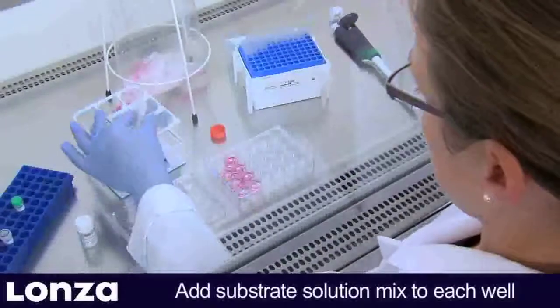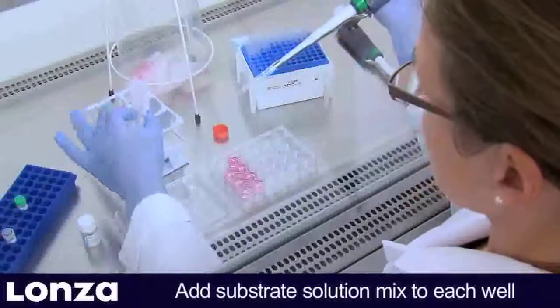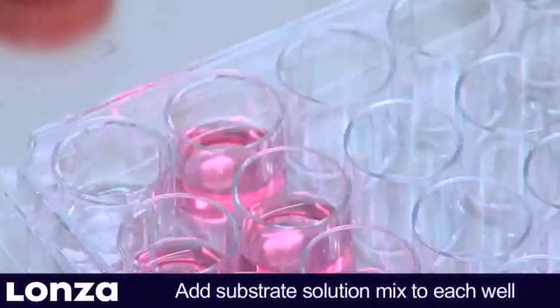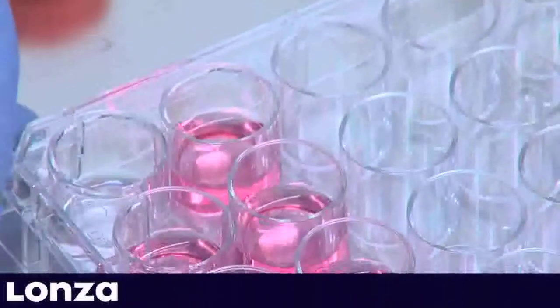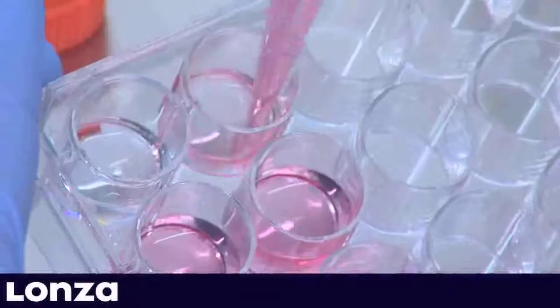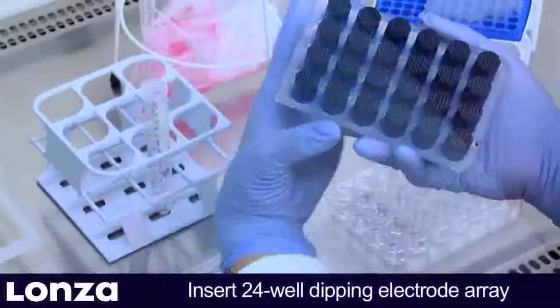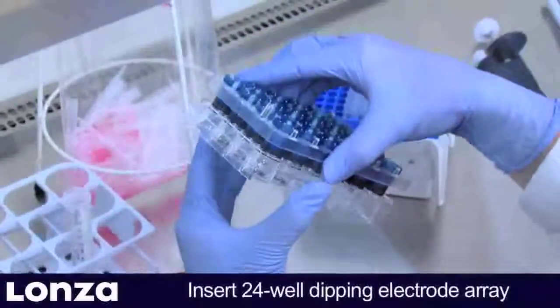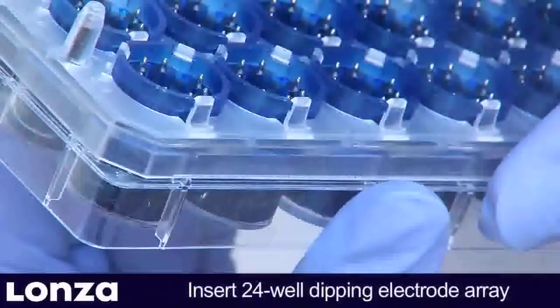Then add substrate solution mix to the well. To avoid leaving cells without liquid coverage, it is recommended to perform media removal and addition of substrate solution mix one well at a time. When inserting the dipping electrode, make sure to use the correct orientation and avoid bubbles underneath the dipping electrode. It is best to hold the plate at a 60 to 75 degree angle.